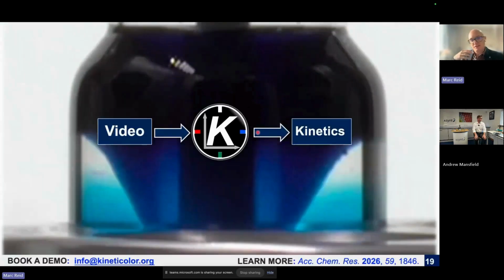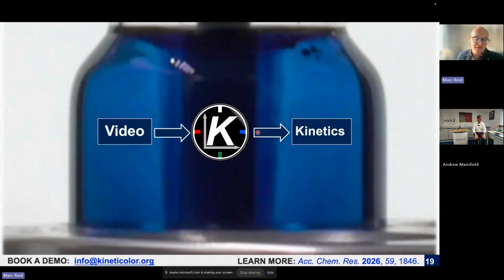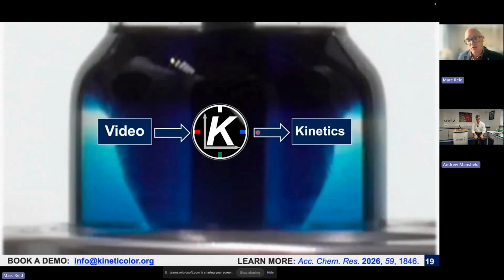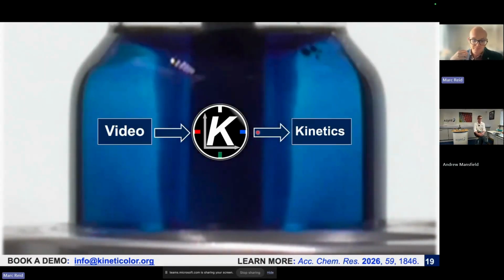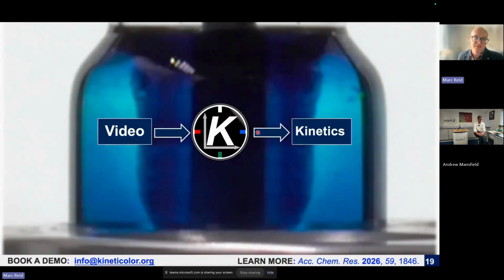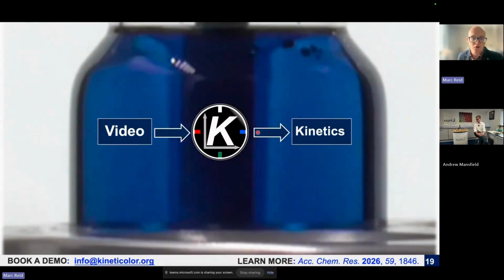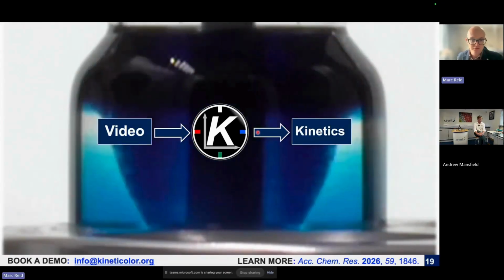So to bring this to the third and final story, this now gets us to a stage where after developing this understanding of mixing with Kineticolor, we had the opportunity to consider how might we understand mixing profiles in some of Asynt's apparatus, with the detailed efforts that they're taking to understand how to improve mixing on a lab scale, all once again anchored on taking video data in and producing bulk kinetics as the output.